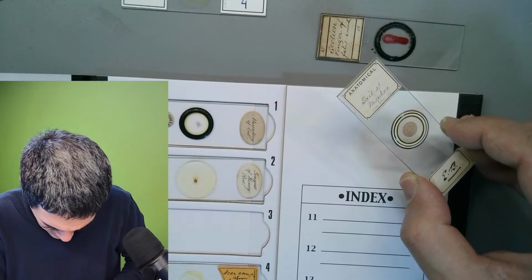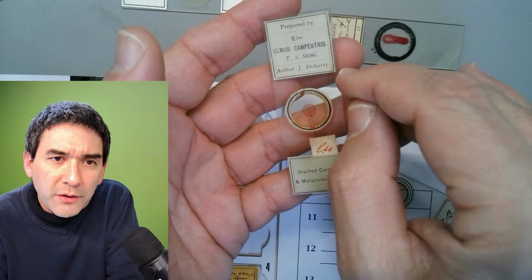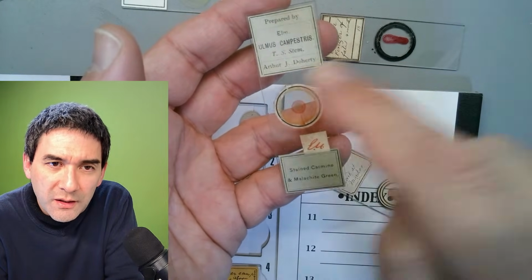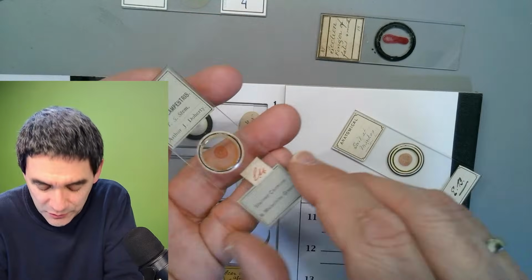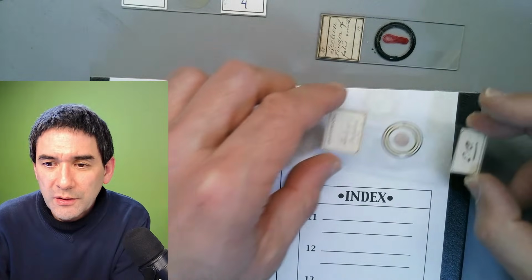similar to the one of, maybe it's from them. Arthur J. Doherty, right? He's always making those ringed patterns in here. So maybe it's from the same one. I don't know. So the monkey tail, that's an interesting one here.